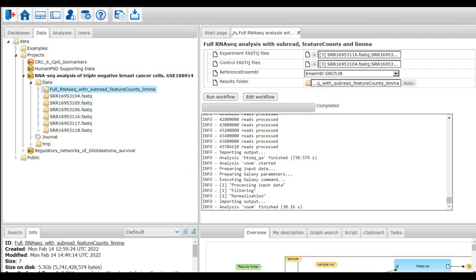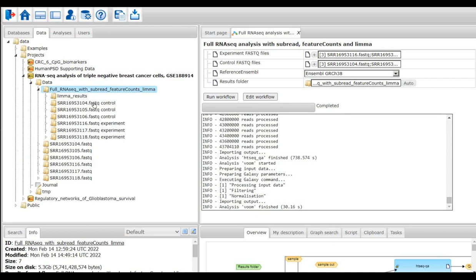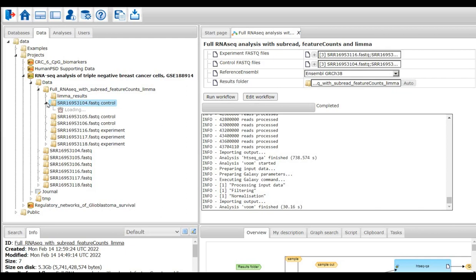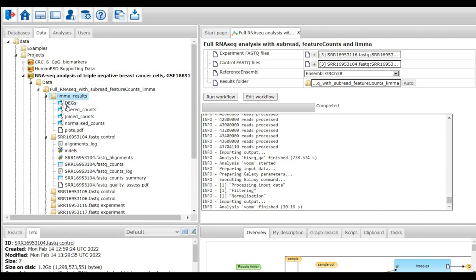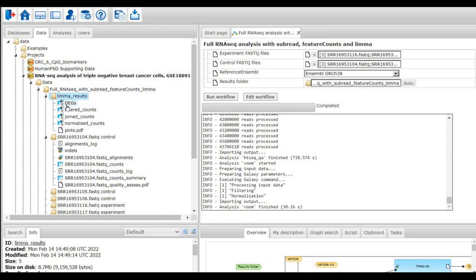As we can see here, the output folder is generated and there are a lot of output files within the output folder. They include the alignment files, the count summary, count log, and the list of differentially expressed genes. Now I'll take a break. To make a short summary of this part, I defined the dataset for analysis, uploaded FASTAQ files, and started a pre-existing workflow to calculate log fold change and p-value. In the next part, I will discuss about the output files in detail.